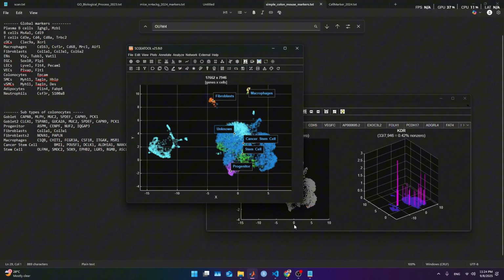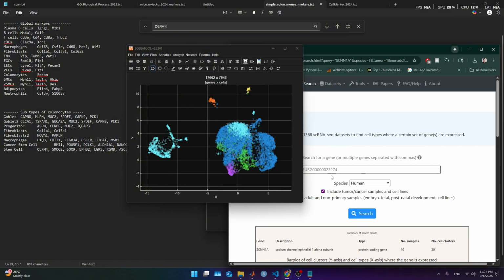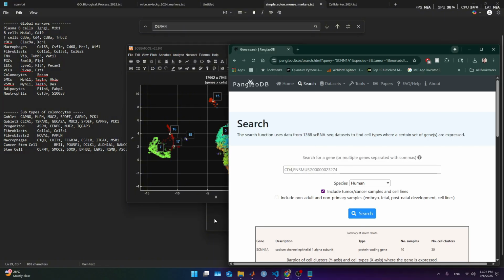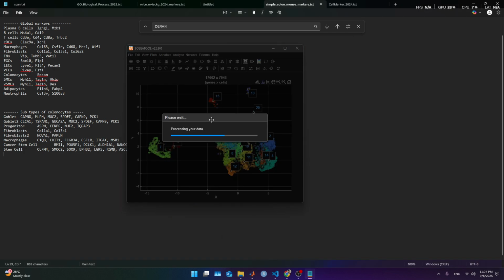For now, what that cluster was, I just want to see. Cluster ID. What cluster was that? Gonna close and redo it. The 18, right? Was the 18? Top 20. And let's see what's in there.